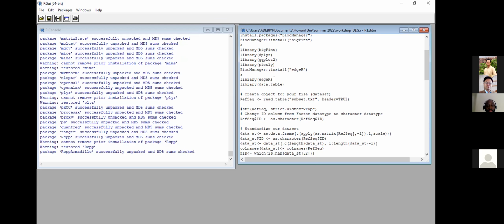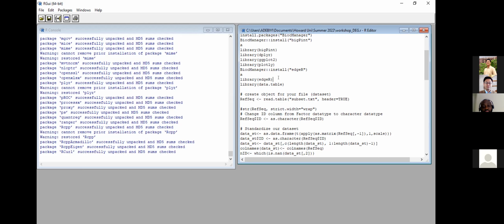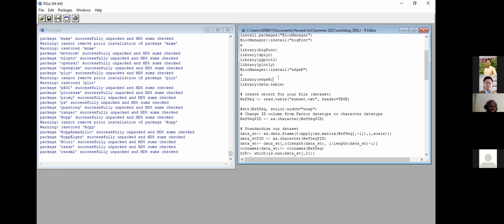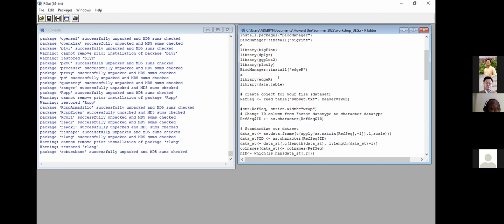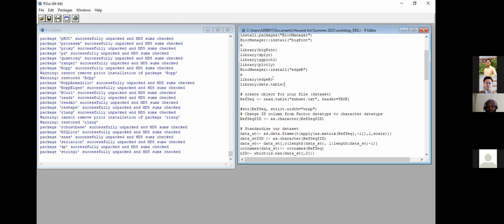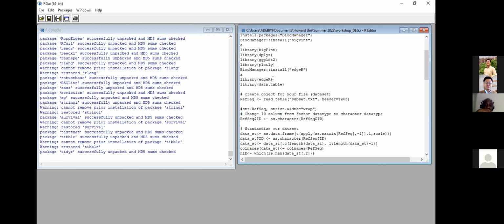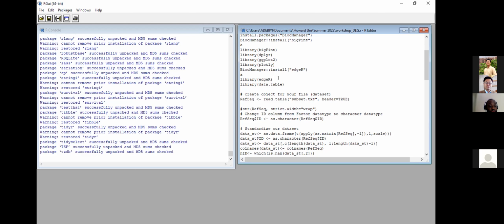This is taking longer than usual. Let's see. Okay. table.